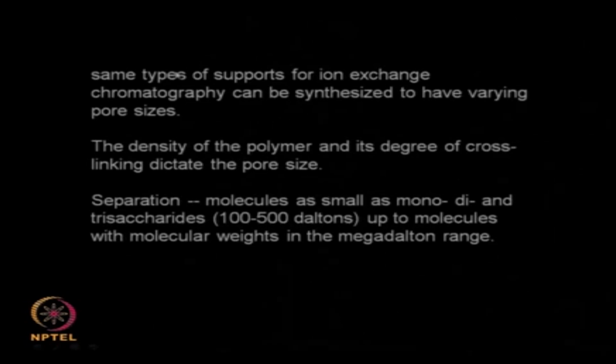So these supports are also similar to the supports that are used in ion exchange chromatography, and we can synthesize them with varying pore size, because this technique is totally based on pore size. Smaller pores will allow small molecules to get entrapped, larger pores will allow only large molecules to get entrapped. So if I have small pores, larger molecules will not be able to enter. So it is based on the concept of size. So we can synthesize pores of different sizes, okay.